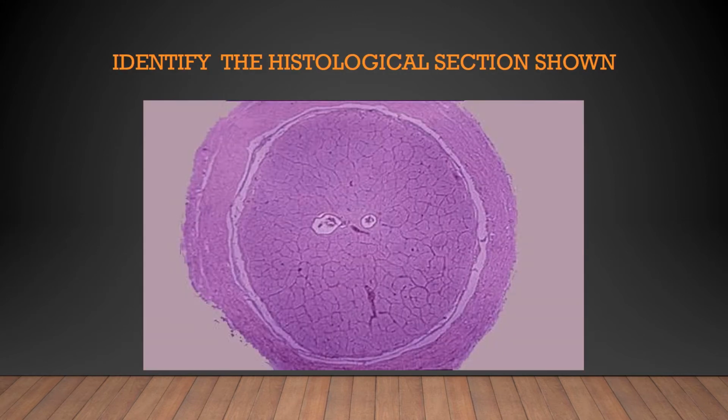So this is the slide of the optic nerve, and that's due to the presence of the central retinal vessels and meninges. So let's take a moment to discuss the connective tissue coverings of nerves. So you have the epineurium, which covers the entire nerve. And then you have the perineurium, which will cover a single bundle of nerve fibers, and the endoneurium, which covers individual nerve fibers, similar to that of muscles, where you have the epimysium, perimysium, and endomysium.